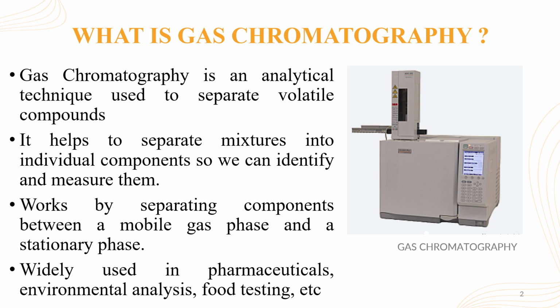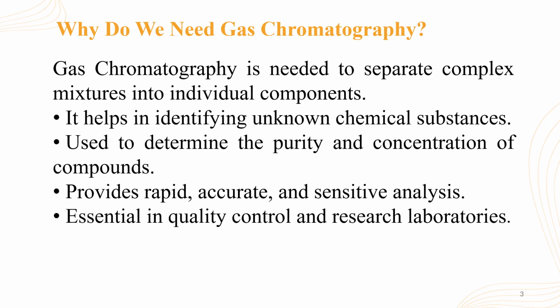Now, if we observe the image in this slide, it shows how the sample mixture enters the gas chromatography system and gets separated into individual components inside the column. Why do we need gas chromatography? We need gas chromatography because many chemical samples contain complex mixtures. GC helps to separate those mixtures into individual components.